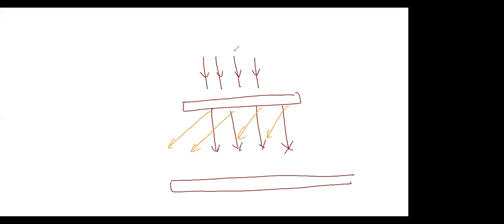Ideally, it will be like a cone, right? But we are showing a two-dimensional picture, very simplified. Ideally, it will be a cone, three-dimensional diffraction. So suppose this is theta. You can collect these electrons and you can get electron diffraction.